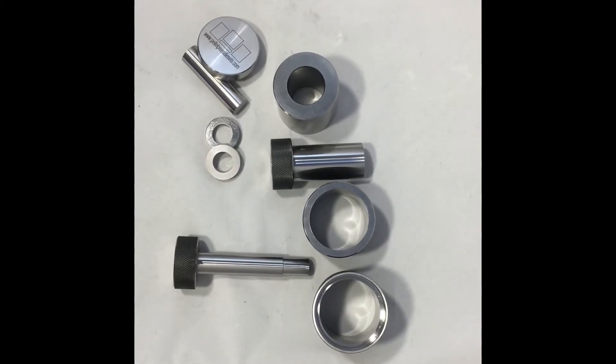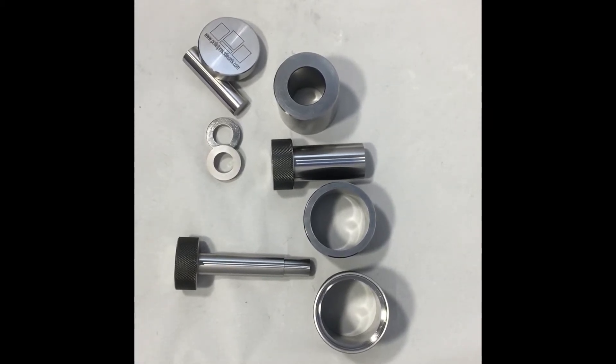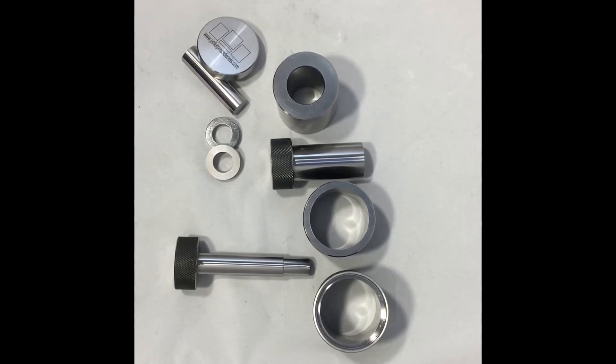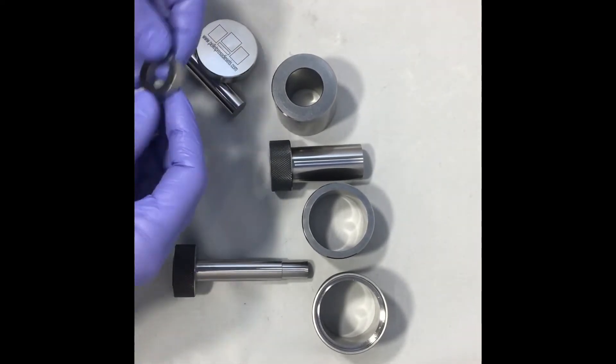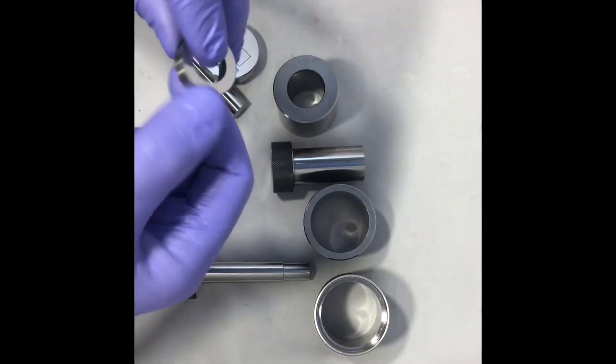Hey this is Joe from Pellet Press Die Sets and today we're talking about our annular die set. This is a die set for making ring-shaped pellets. The pellets will come out kind of like this shape.